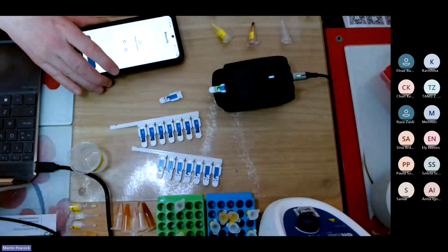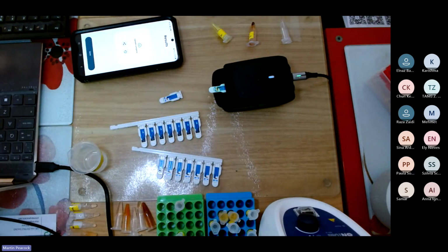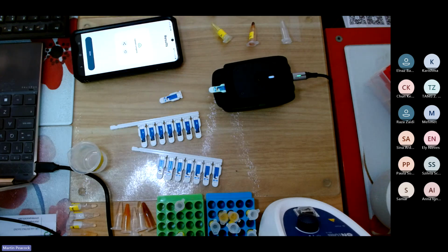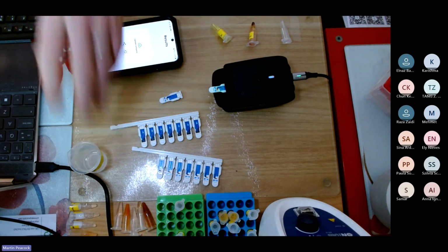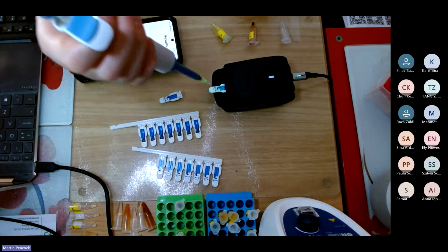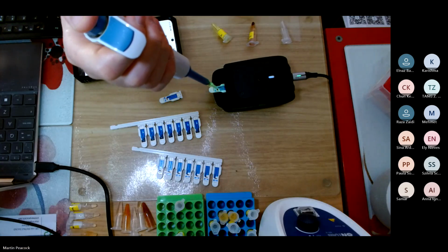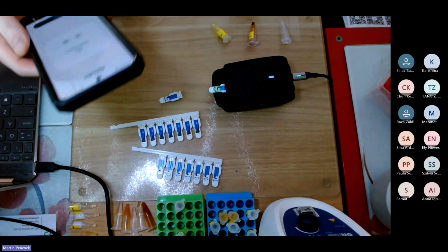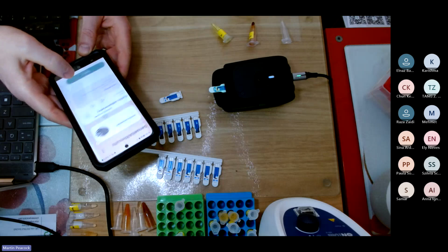Right, now I'm going to clean this electrode with an acidic solution. I'm going to use pH 2. I'm just using what I have at hand. I'm pretty sure you can get away with pH 1 as well, but I will use pH 2 because that's what I have at hand. So let's clean, let's activate this electrode. Not a terrible thing to do, because in fact we do activate our electrodes when we're manufacturing products upon them.